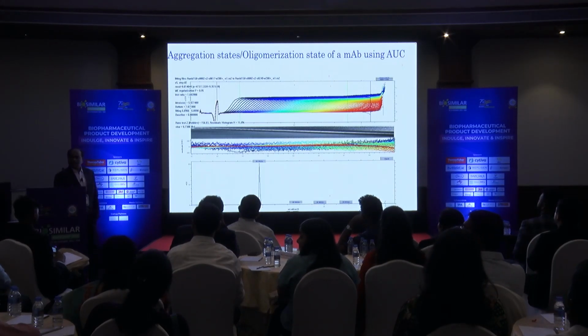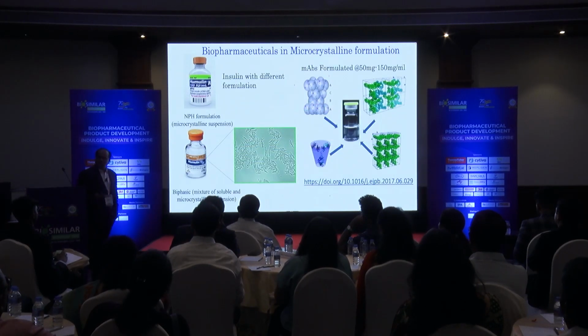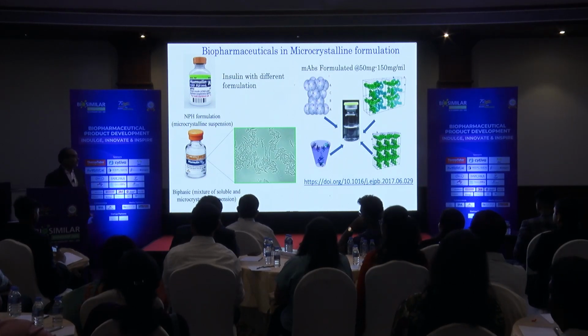And then you can combine that with AUC, and look at whether they are not aggregating or fragmenting. So you can see clearly a 150 kilodalton single peak coming, and that can be clocked. Give me 2 more minutes. I have exciting news to share with you.